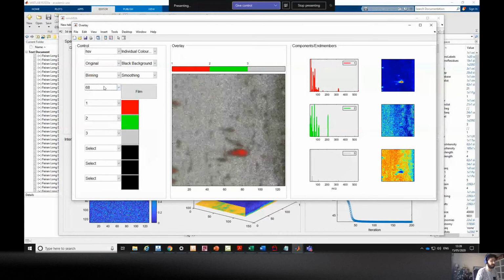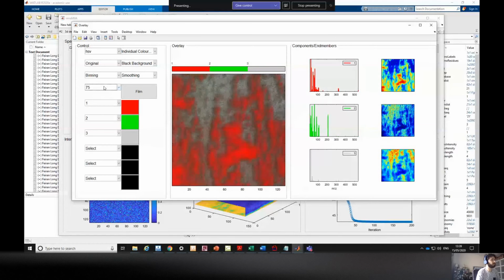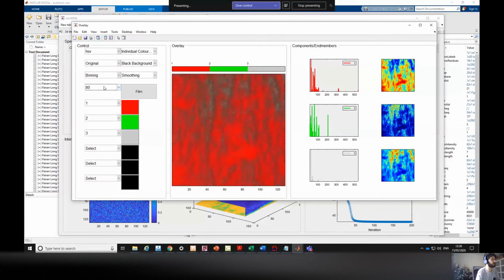So, you know, I'm pressing arrow down. I click here and press arrow down on my keyboard, and you can see it changing, because now we have this information. Right? Before it was all compressed into a depth profile, but you can see here there's some XY information. The change is not sharp. The reason behind this could be because of differential sputtering, or even because the way the material was created or printed is not homogeneous, and the thickness is actually not homogeneous.